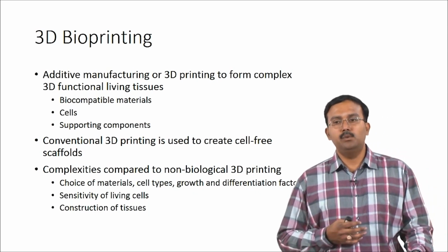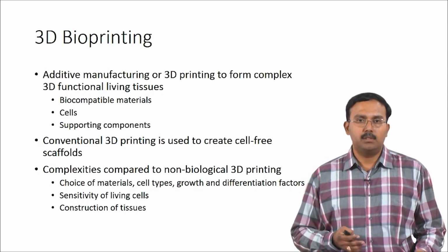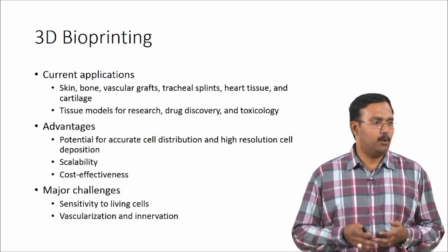Currently people have tried to print different tissues using 3D printing. Some of these have actually been reported in literature.